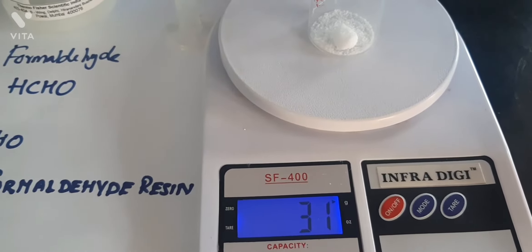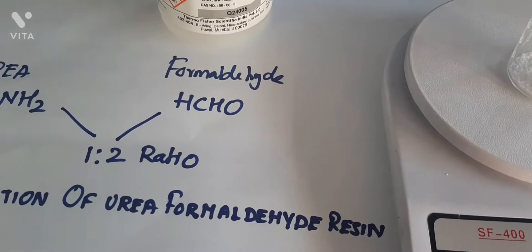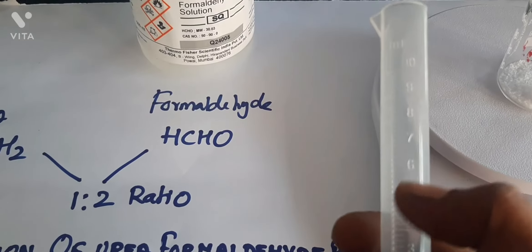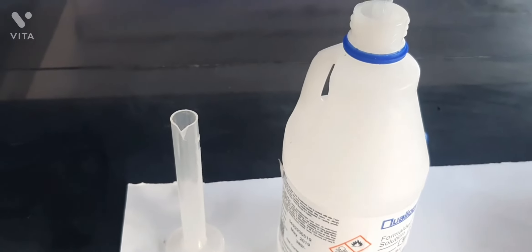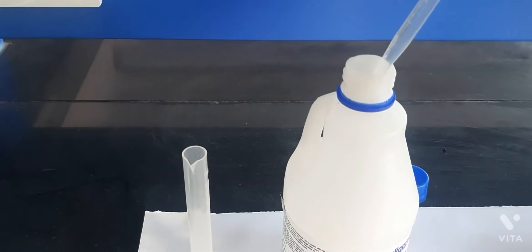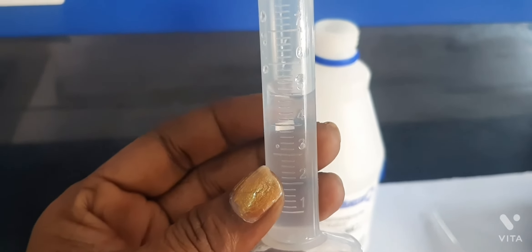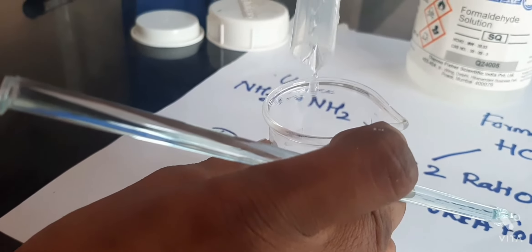To this 2 grams of urea, around 4 ml of formaldehyde must be added. To add formaldehyde, we should use a measuring jar. The 10 ml measuring jar is used here. Using a dropper, formaldehyde must be taken from its container and dropped into the 10 ml measuring jar until it measures around 4 ml, then it can be added into the beaker containing the 2 grams of urea.